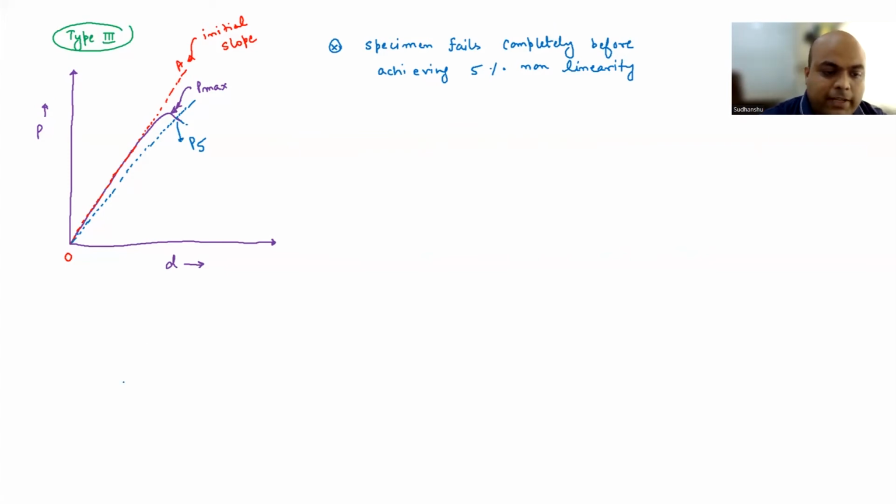Now we have to calculate PQ. So to do that, we have to again move from the origin, upward in the purple curve, right? So we'll start from this particular point and now we'll move. So now we have to note down the load values. So all these yellow dots, these load values are till now lower than P5. Okay, but we reach a value which is the highest one before it reaches P5, right? So the second condition, condition B, is now valid. So let me now denote this particular point, the P max, as point C. So this will become equal to PQ.